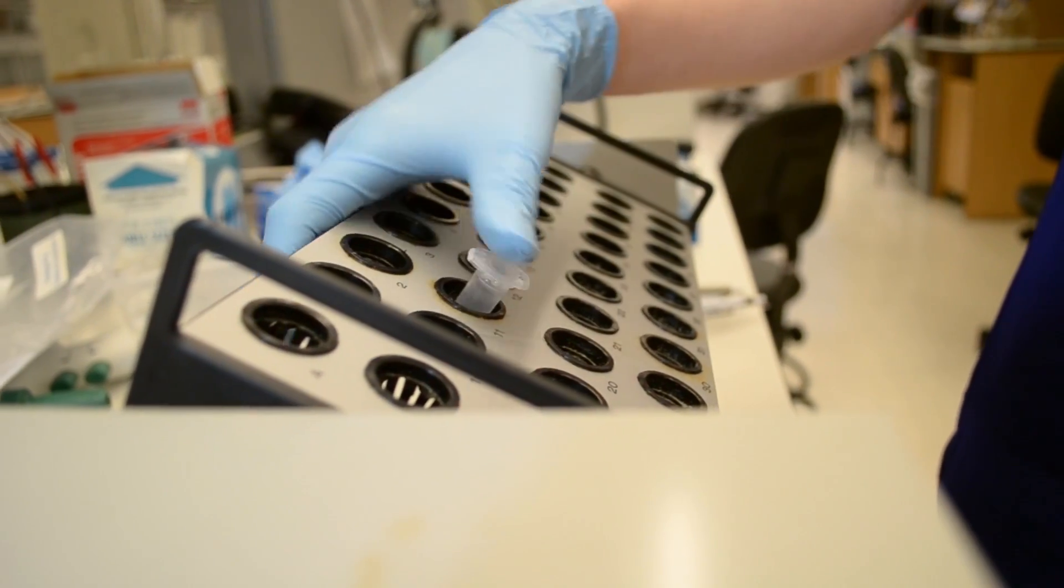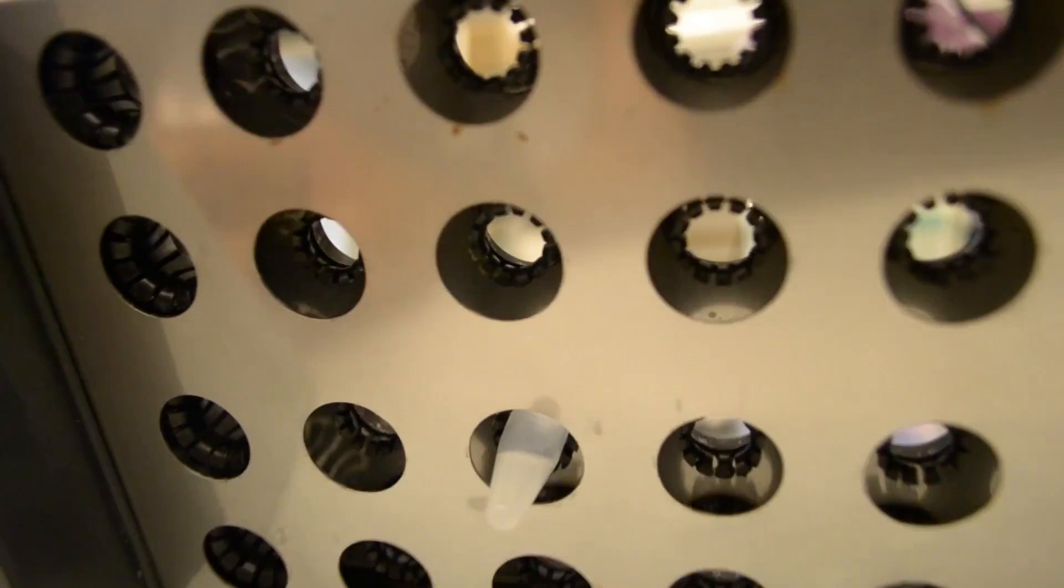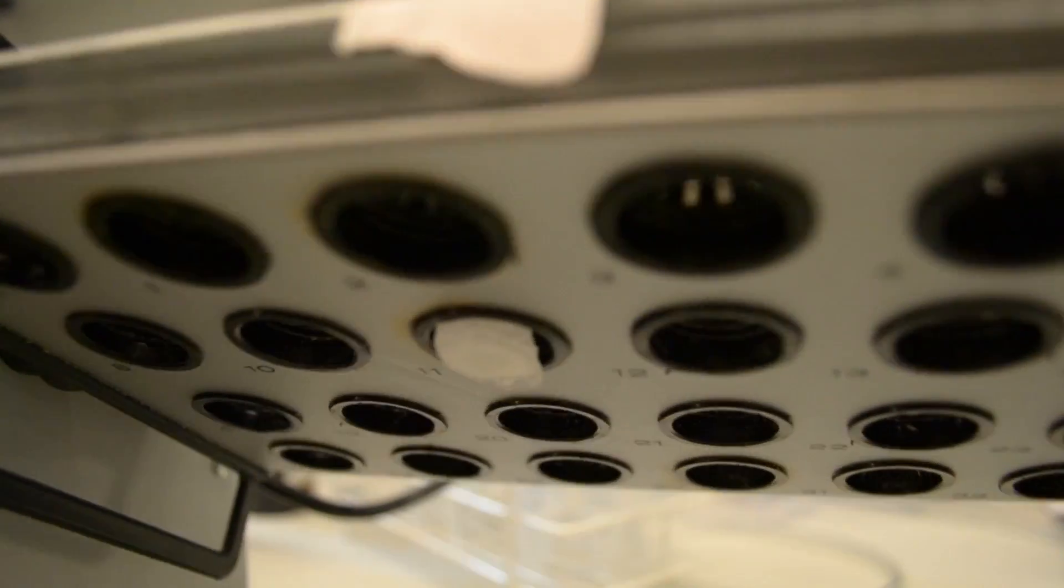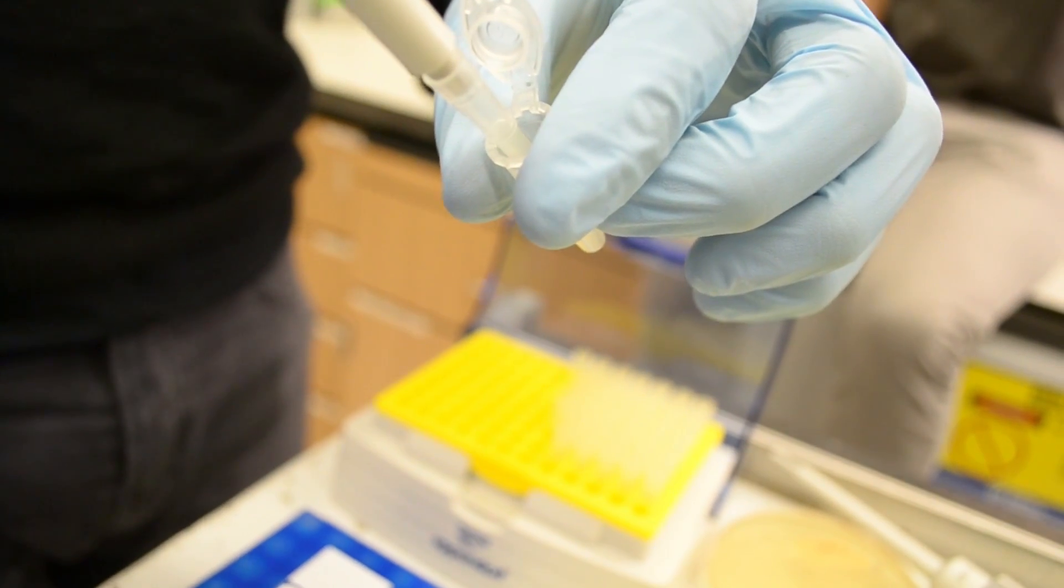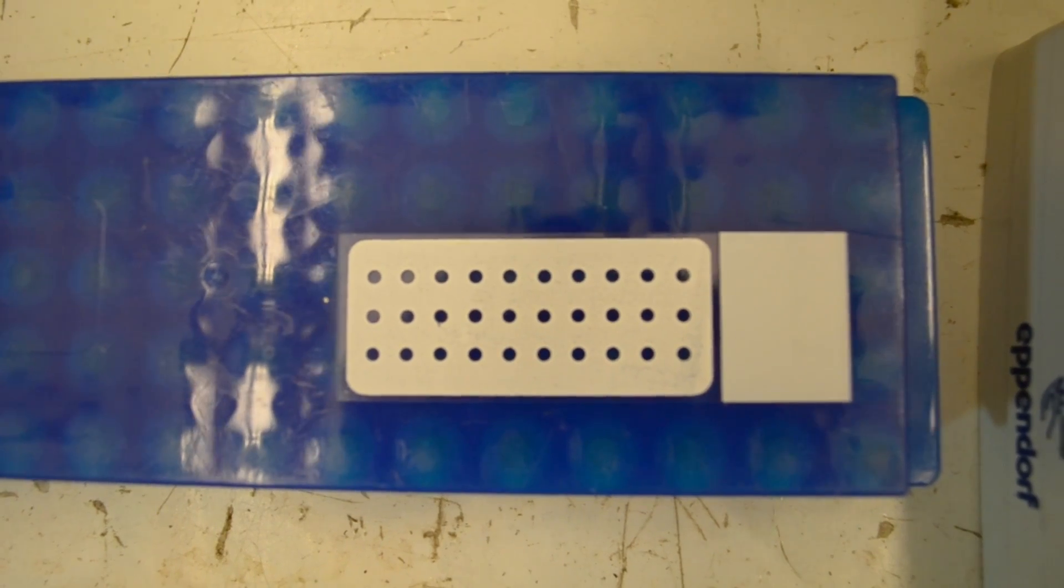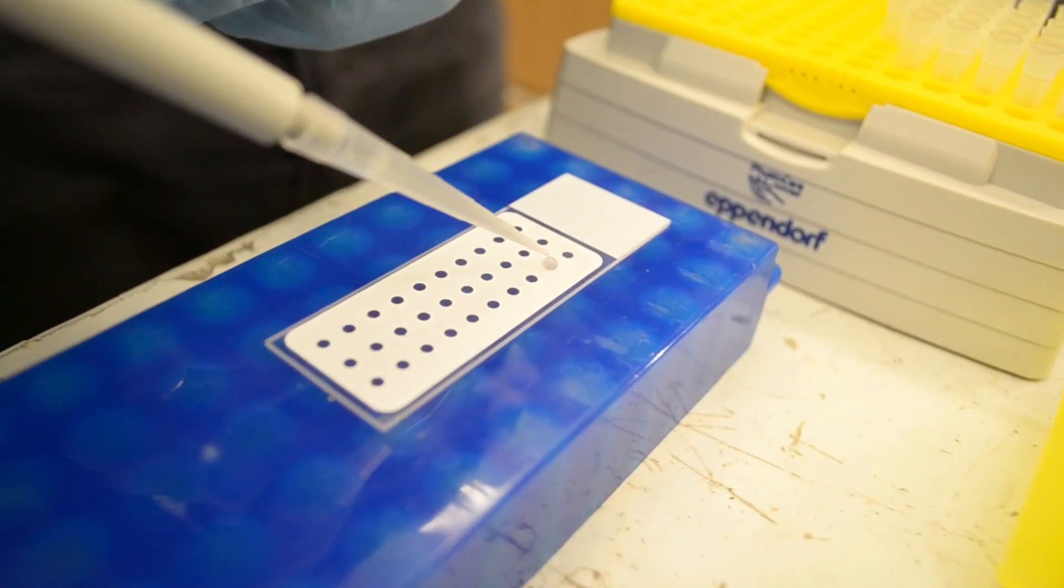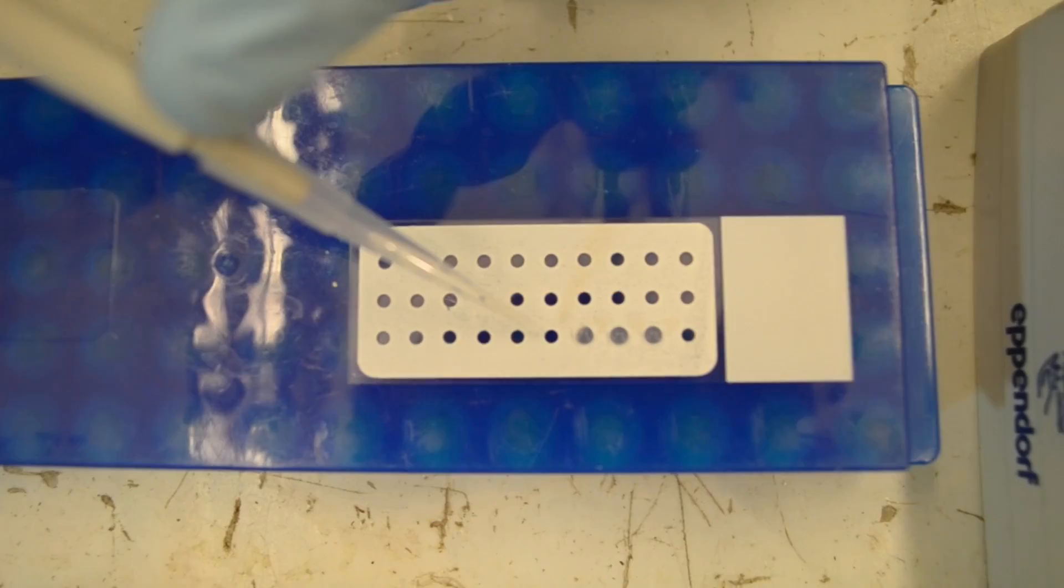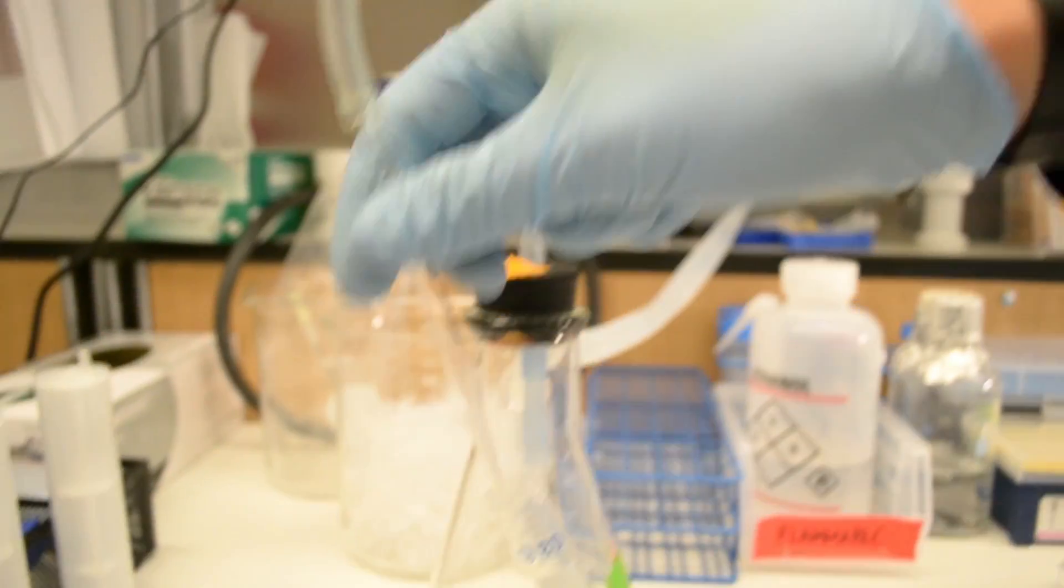Now we're going to take these cells and put them onto our microscope slide. This slide has lots of little wells in it. This means the cells will sink to the bottom, stick to the glass, and in the next steps they won't wash away.